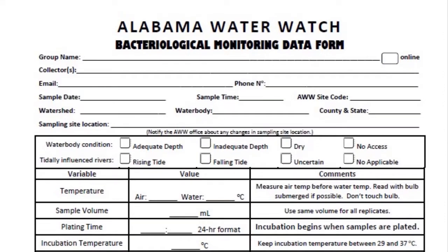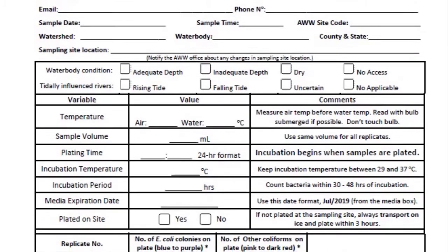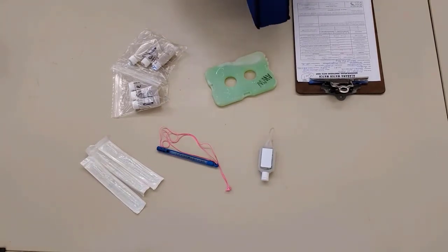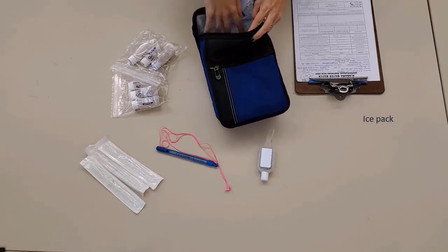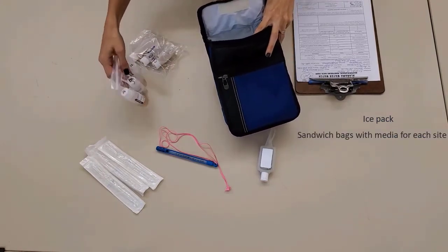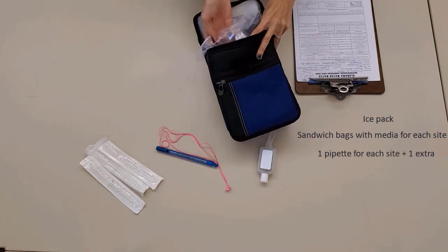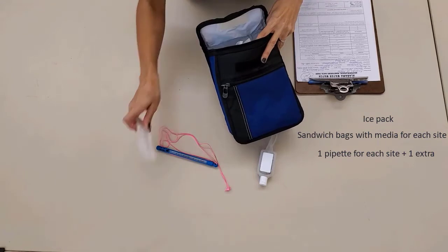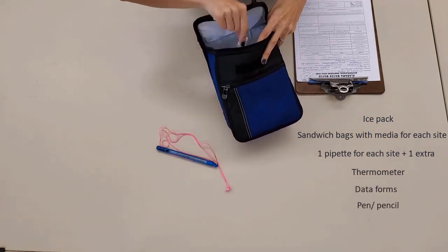You will continue to fill in the remainder of your data form in the field and when you determine your results. Now, let's pack our cooler for the field with our ice pack, 2 sandwich bags, each containing 3 media bottles for our 2 sites, 3 pipettes, 1 for each site and 1 extra, the thermometer, our data forms, a pen, and hand sanitizer.